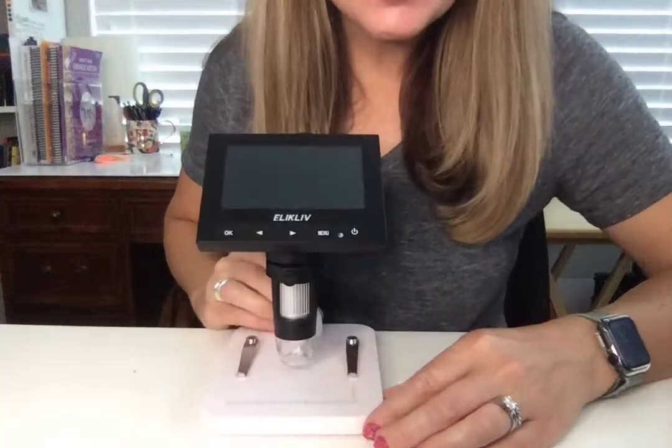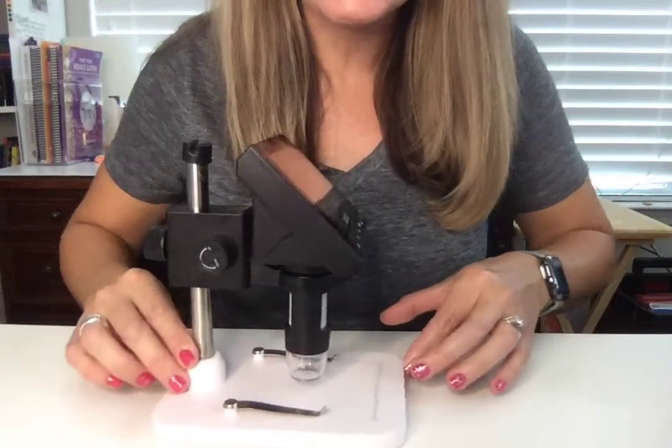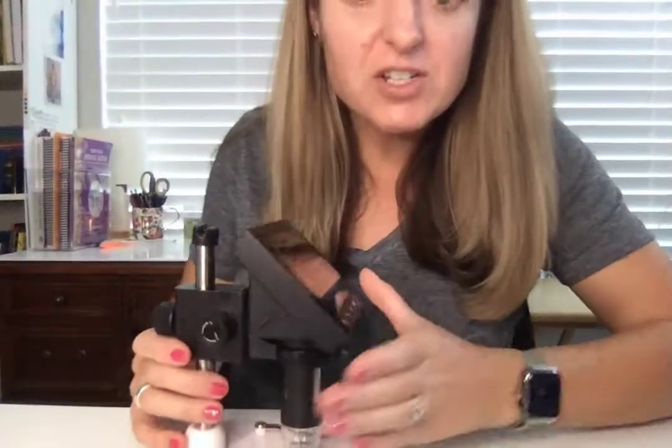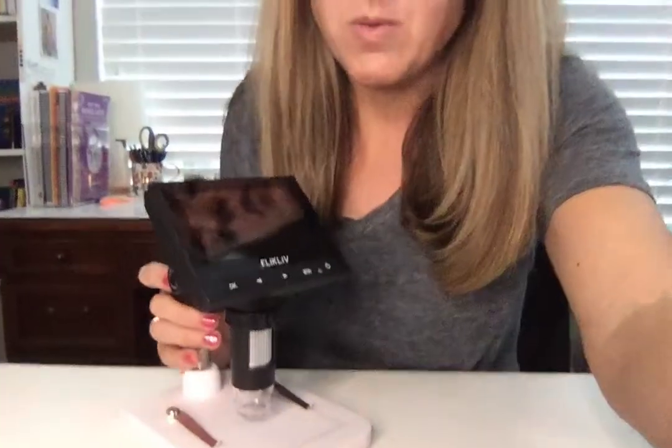This is a digital microscope, which means that instead of having to look through a little viewfinder and get your eyeballs just right, we're actually going to be able to see the image on a screen. So I'm going to show you how it works.